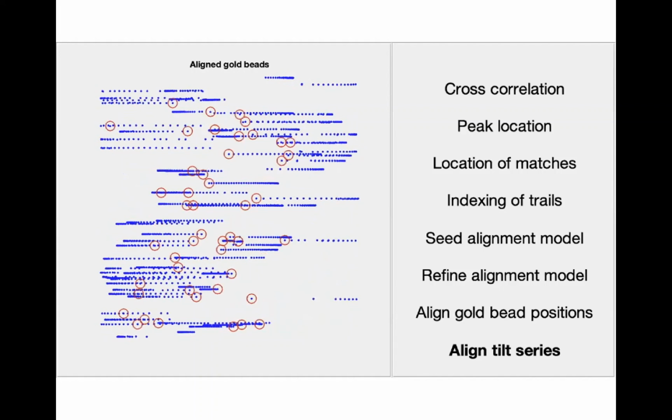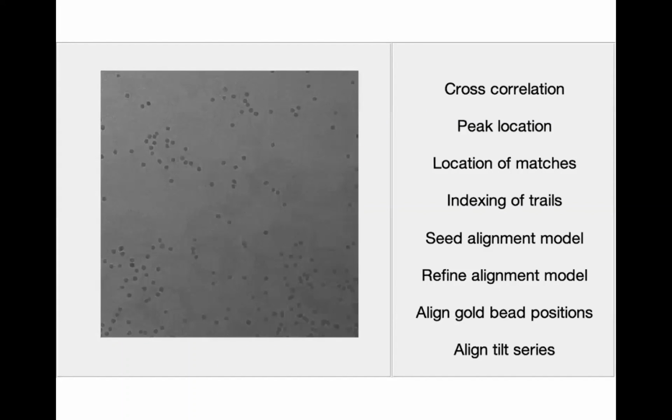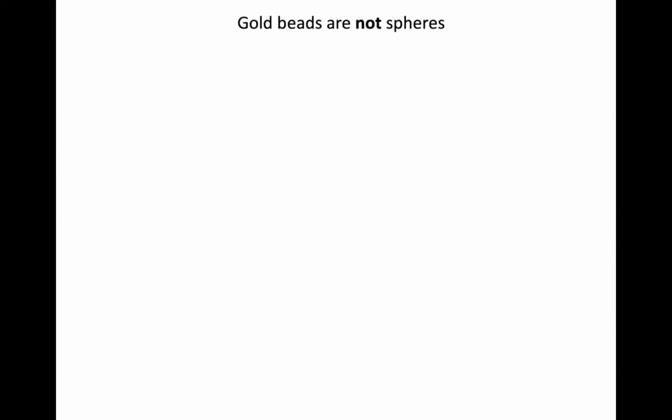This is what you want to see at the end of the day: a smooth transition from a projection to the next one.